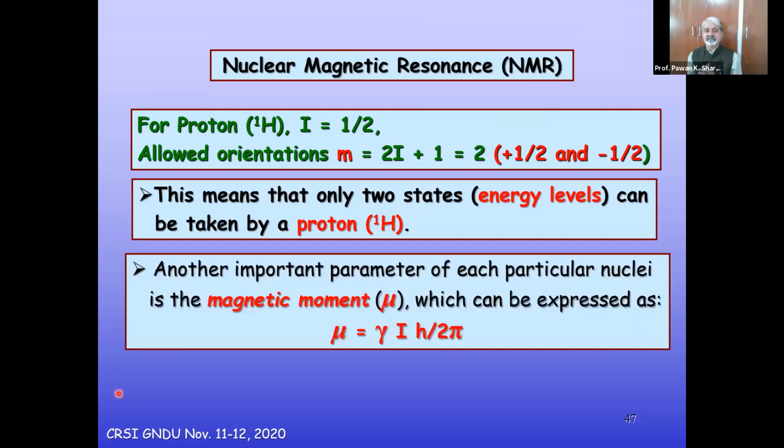Another important parameter of every particular nucleus is the magnetic moment.